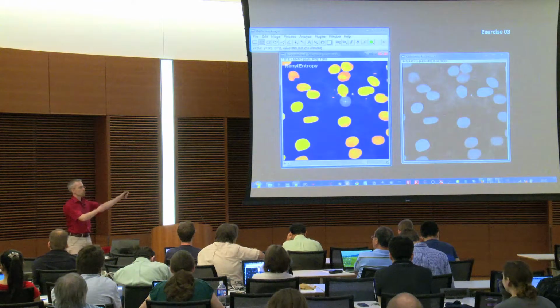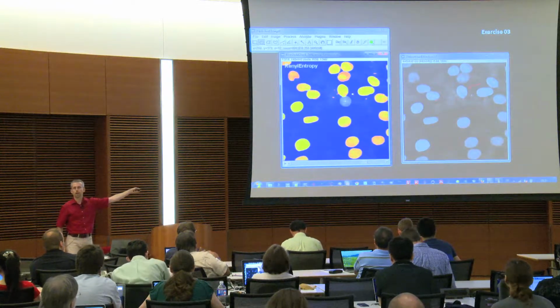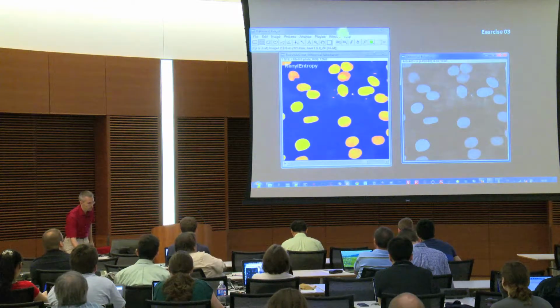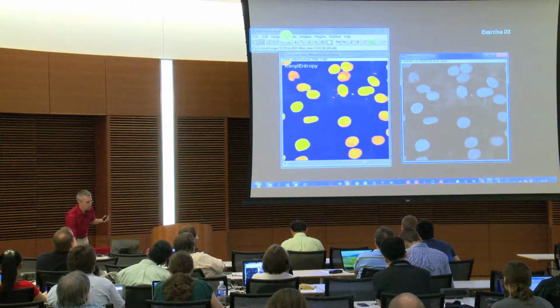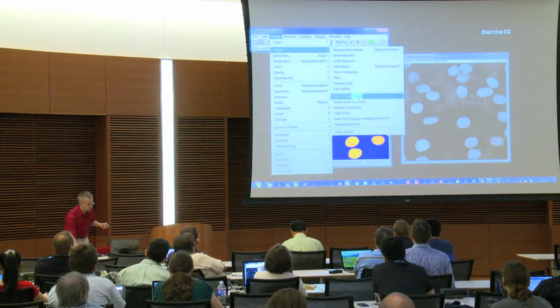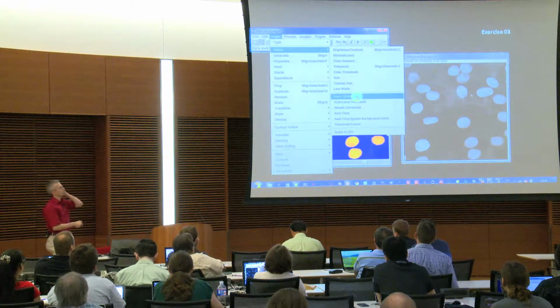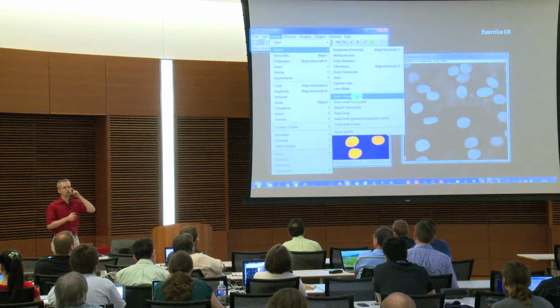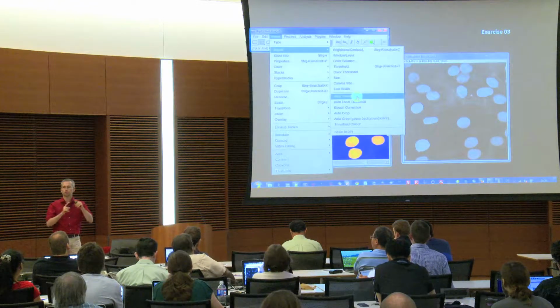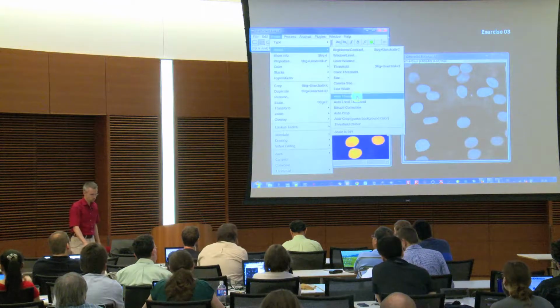So if I have made this choice, this is just the decision-making process. Then I still need to apply it to the image. So I go back to my original, or my filtered processed image, and use the standard function. So I go to image, adjust, and auto threshold. And careful, because the threshold check uses these auto thresholds. In this manual thresholding dialog, where you have access to the auto thresholds as well, there are some differences to this auto threshold, so you need to be careful that you use the auto threshold.